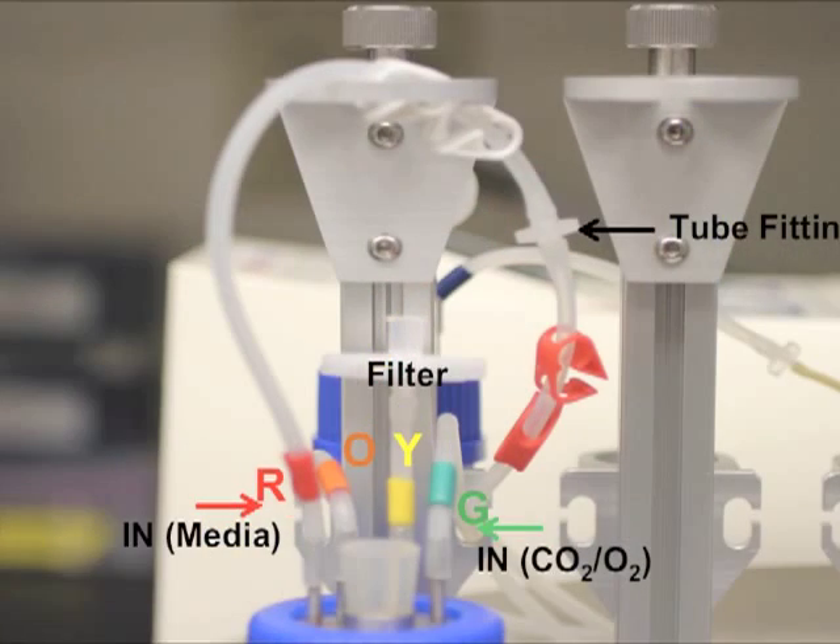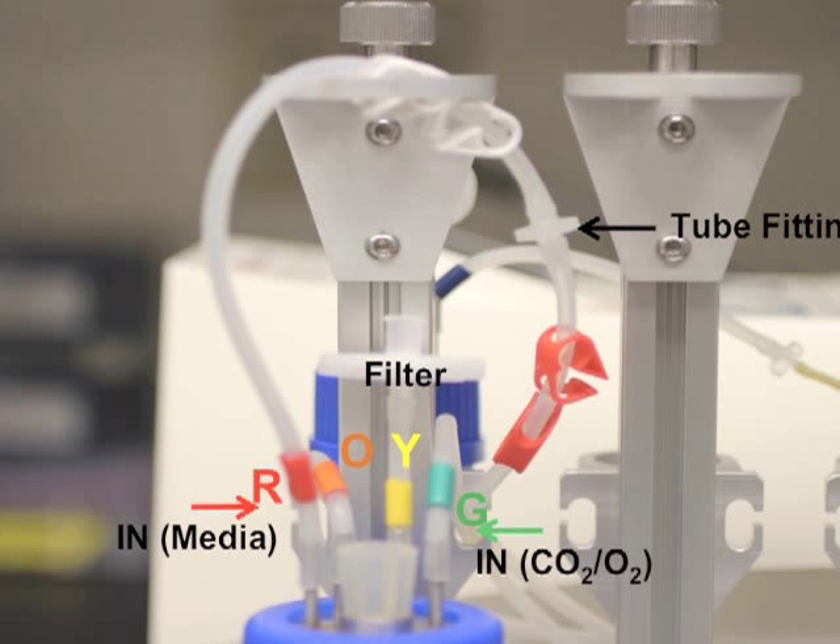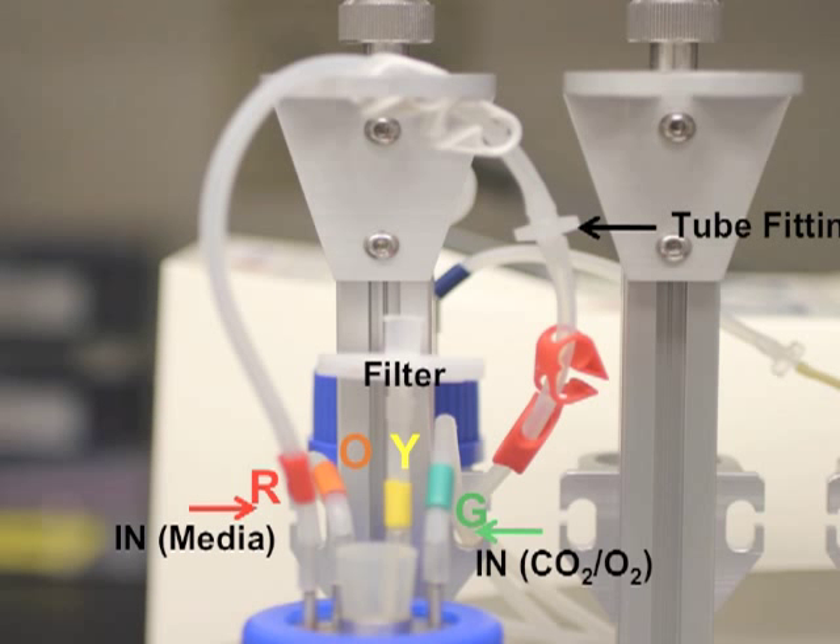The following is a snapshot of the final tubing assembly. An important point: the large tube fitting seen here between the red and white plastic stoppers is used during the media equilibration step. Later in the process, the plastic tube fitting will be replaced by the 3D perfusion chamber.